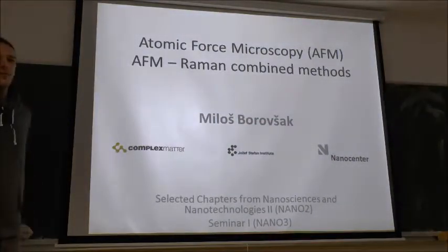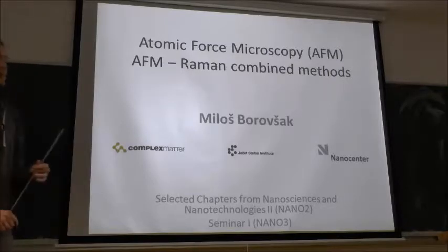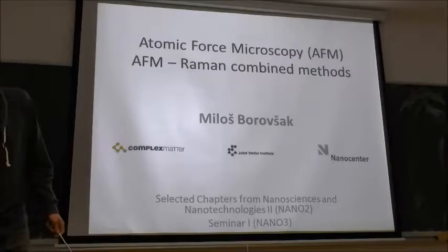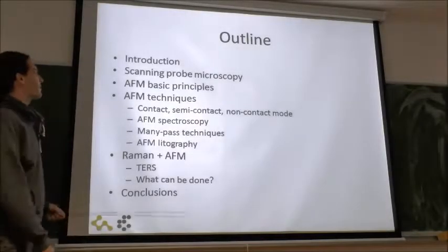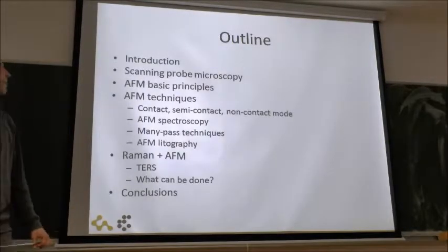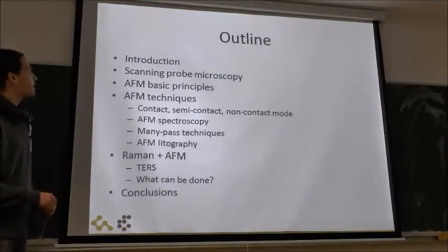I'm Milos, and I will present to you atomic force microscopy and the combined techniques of AFM and Raman. I don't know how familiar you are with the AFM, but here's the outline. I will do some introduction to the AFM for those who are not familiar with it, some principles.